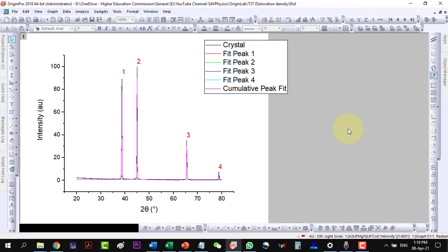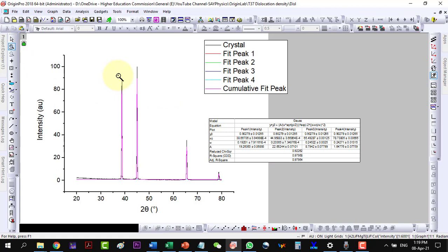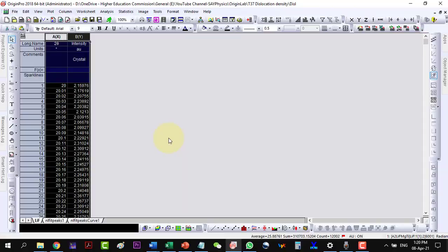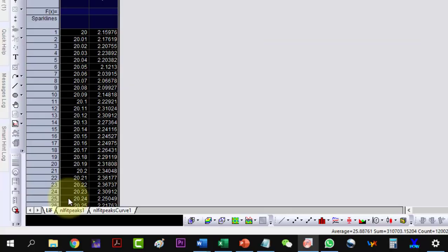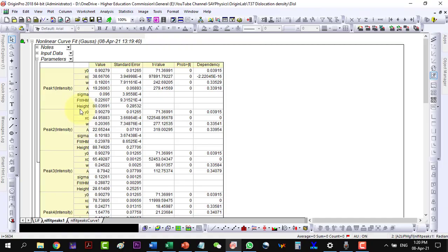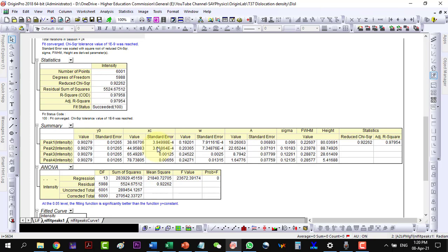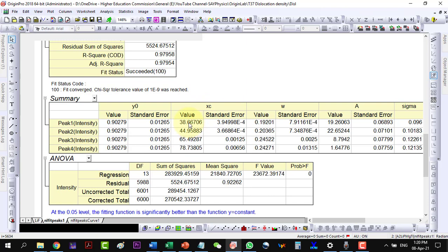So here I have fitted 4 peaks. Now go to the data under the non-linear fit peak 1. Under the summary table, these are the two theta values. Let us copy the values.